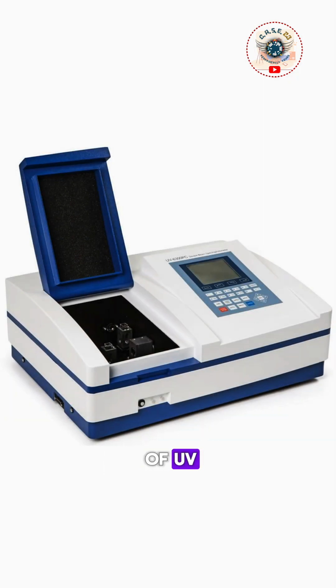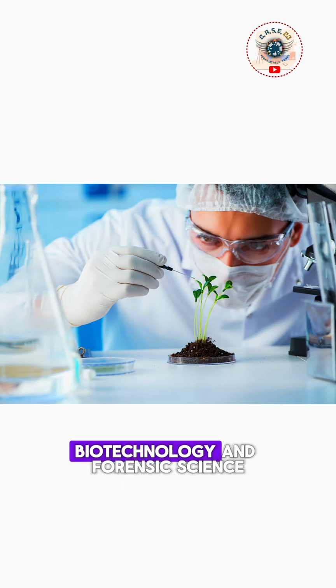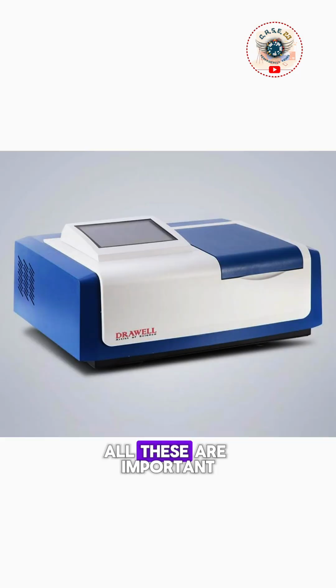The applications of UV visible spectrophotometry are in the pharmaceutical industry, biotechnology, and forensic science. All these are important points about UV visible spectrophotometry.